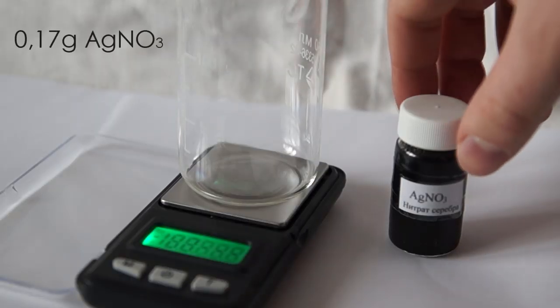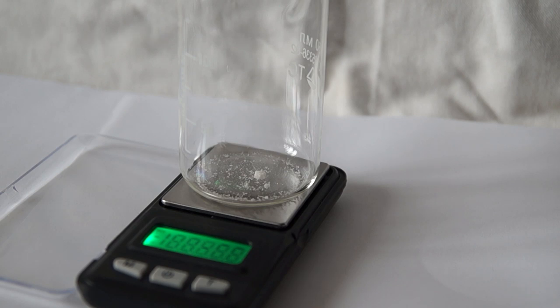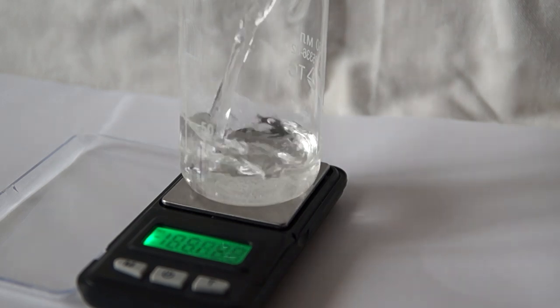For the third solution we need 0.17 g of silver nitrate which will dissolve in 40 ml of distilled water.